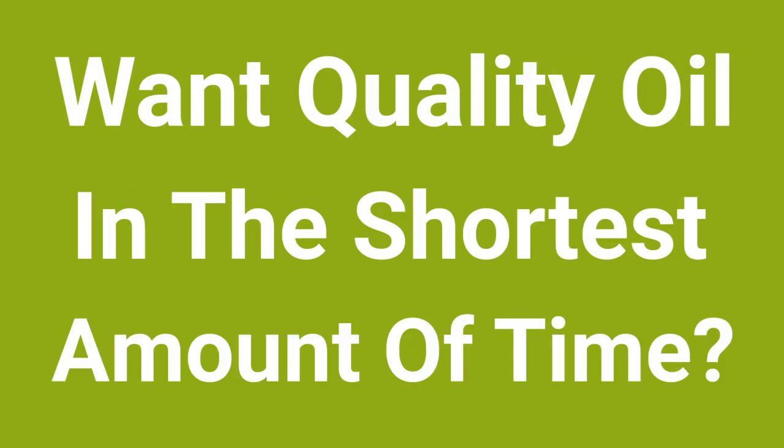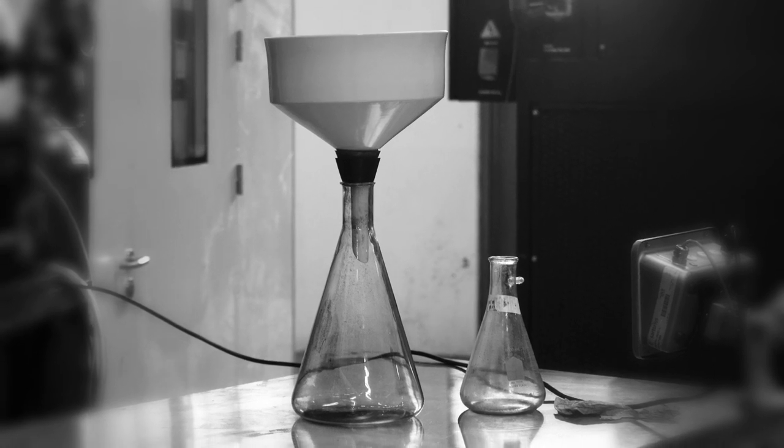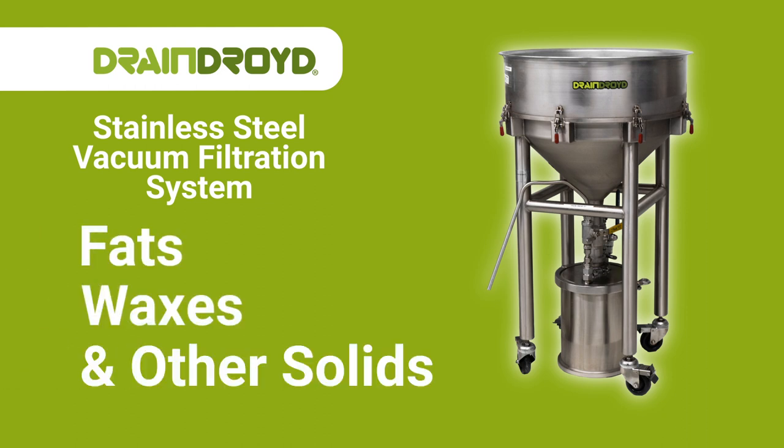Want quality oil in the shortest amount of time? Constantly getting tired of using slow drip Buchner funnels time and time again? Of breaking expensive pieces of glassware? Enter DrainDroid — a stainless steel vacuum filtration system designed to separate fats, waxes, and other solids from hemp or botanical extracts.